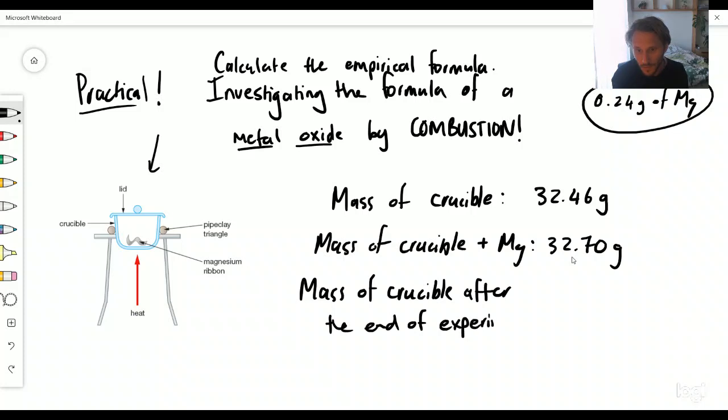So you then get the mass of the crucible after the end of the experiment. Now remember, if you can think about what magnesium oxide is - what's happened is oxygen's got itself into this reaction, it's combined with the metal magnesium. So if you think about this, what would the mass of the crucible be after the experiment - do you think it'll be higher or lower than this number? You'd be correct if you said higher, because oxygen is an element, it exists as something. So if it's now combining on top of the magnesium, that means it's going to have a greater mass.